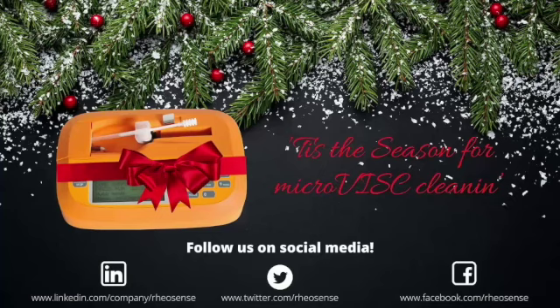All right, great. Thanks, Damien. So just so you guys can see what the flow channel looks like, Zach, do you think you could hold this up to the camera really quick? Yep, so those are our flow channels. That's what is on the inside of your chip. So yeah, just to give you guys an idea of what exactly the flow channel looks like inside. Thank you, Zach.